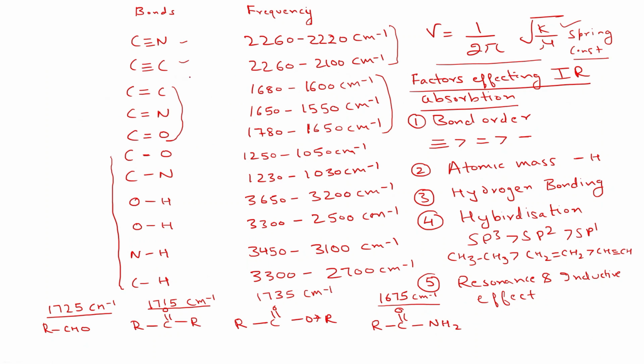So the double bond has a higher force constant or spring constant than the single bond, therefore it vibrates at higher frequency. Now if we compare these two OH bonds, this one is of alcohol and this one is of the carboxyl group.